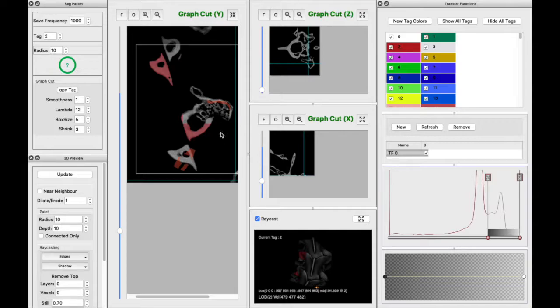See, it's pretty hairy what is what over here in this area. So what I think I'm gonna do is erase all this junk. I'm just gonna go in and manually tag for a few slices. And we can know, oop, see. Ooh, and now we gotta, I think I'm gonna press R, and see, that got rid of that thing too, but it'll be easy to tag that piece. So I'm gonna put some more of that down there.